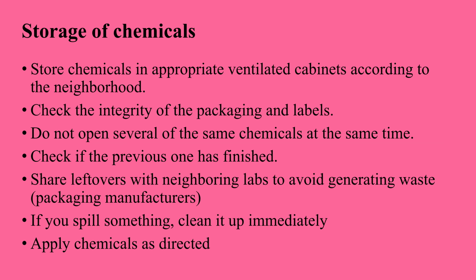Chemicals are stored in ventilated cabinets, and we always check the integrity of packaging and labels. A good practice is to open only one type of chemical at a time, not the same chemical from different packages.